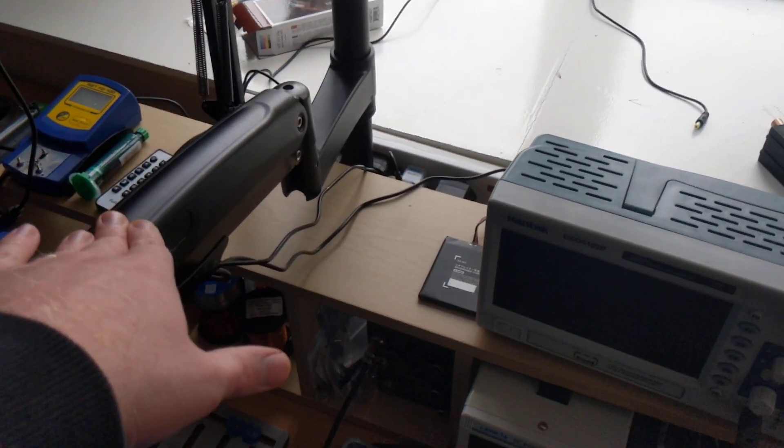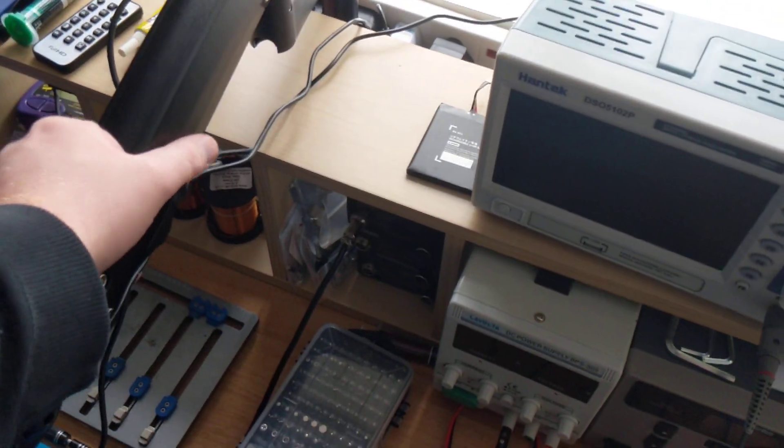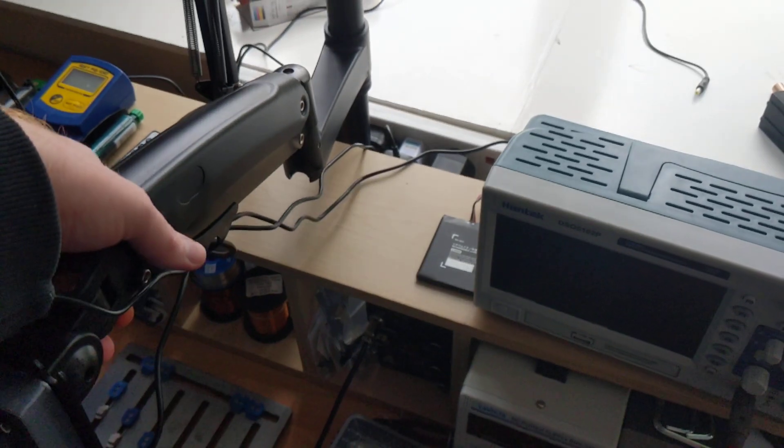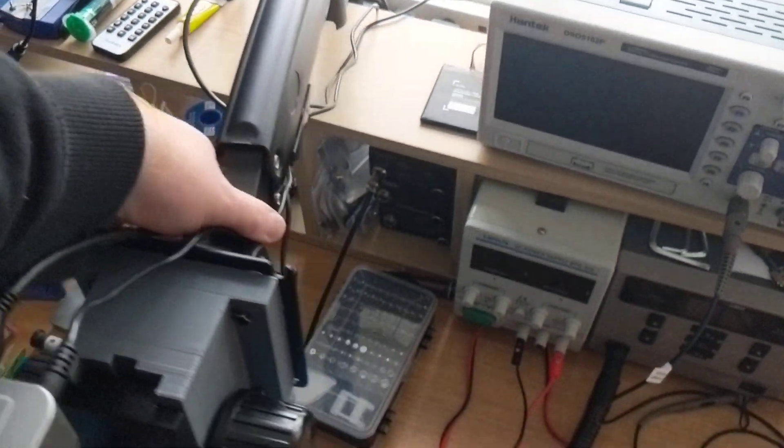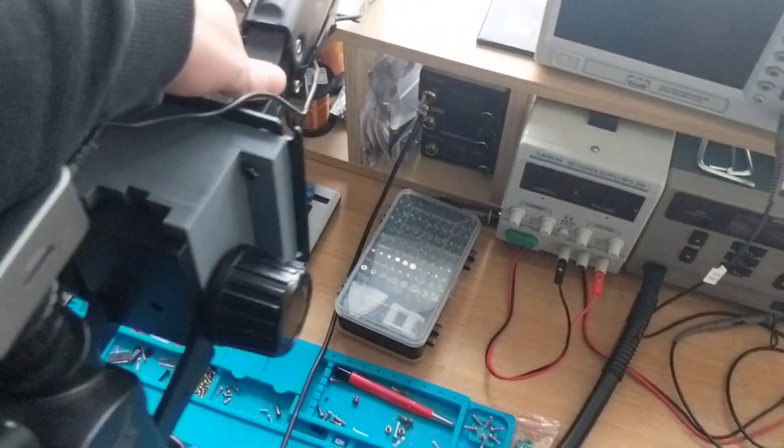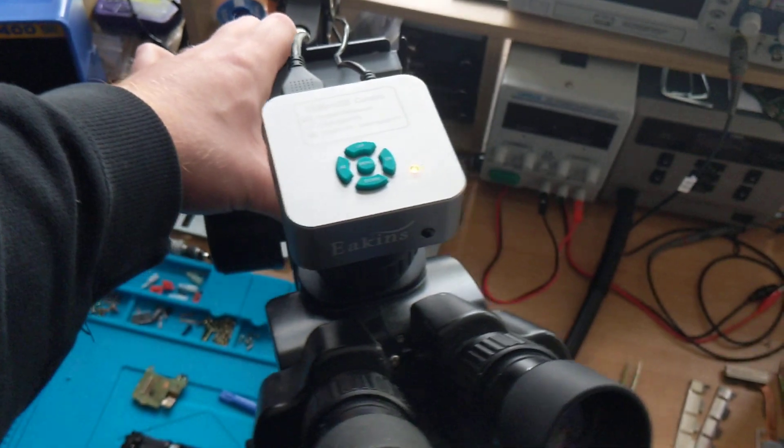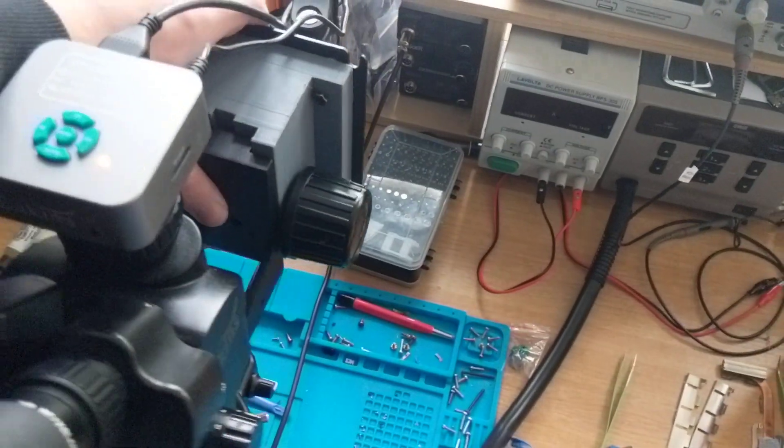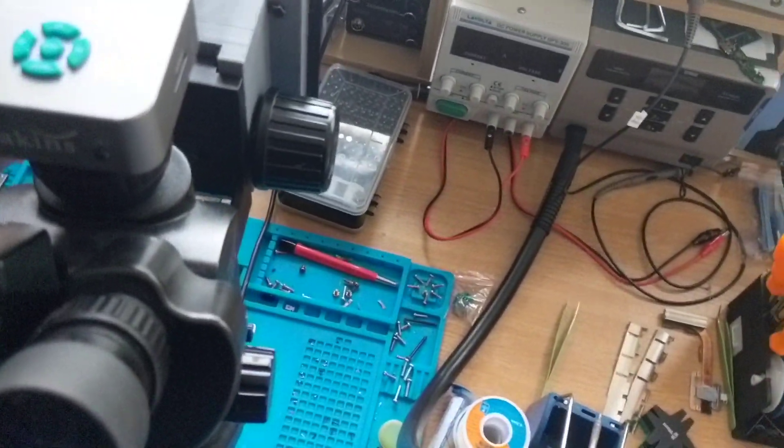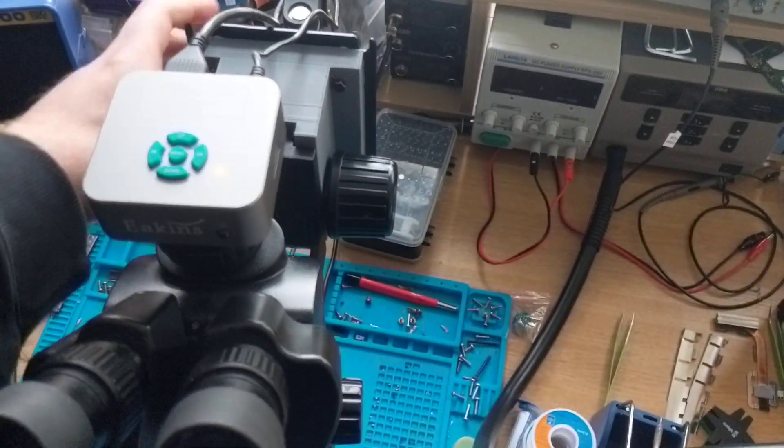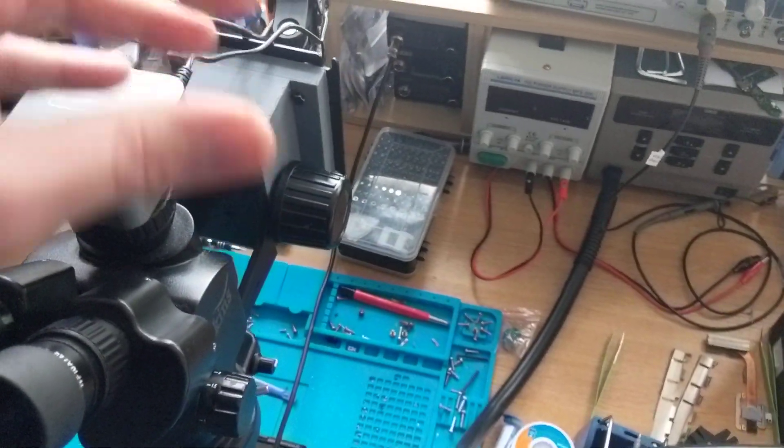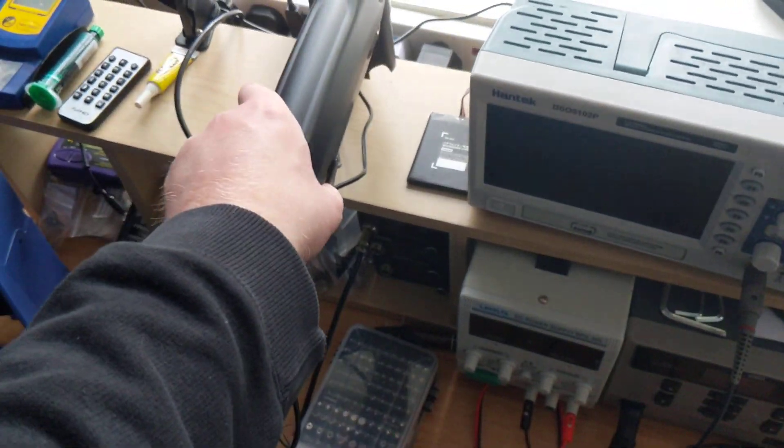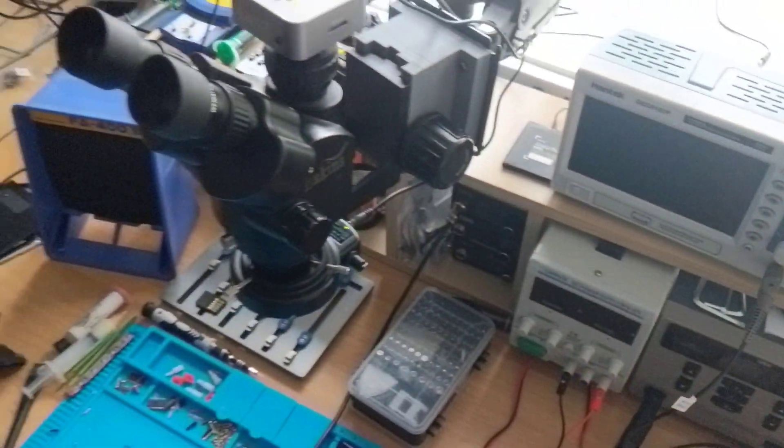In this case this is an articulating arm so that means we can lift it up and down, we can move side to side, we can swivel the head around, we can angle it up and down, but it's quite tough to do that and demonstrate it with just one hand, and of course we can move it out the way as well.